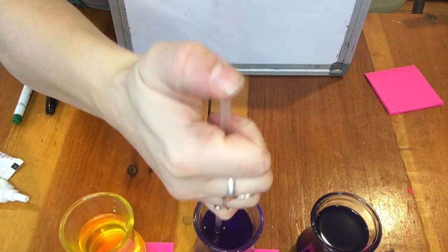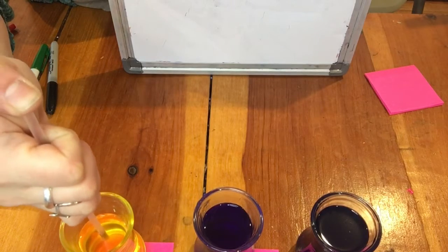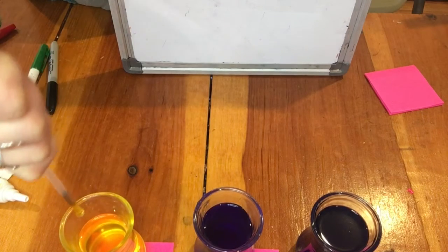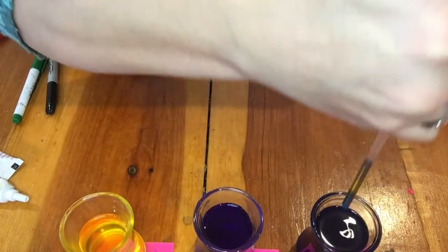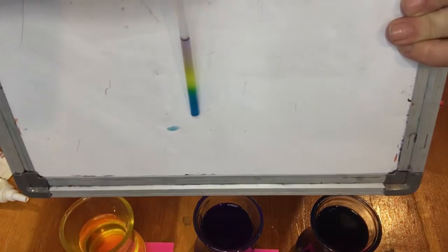So I'm going to take a little bit of solution 2 in the bottom of my straw, and then I'm going to move to the solution with the middle density, which is solution 1. And I'm going to get a little bit more of that. And then I'm going to move on to the solution with the most density, which is solution 3. And here we have our density column. You guys can go ahead and take a screenshot of that.